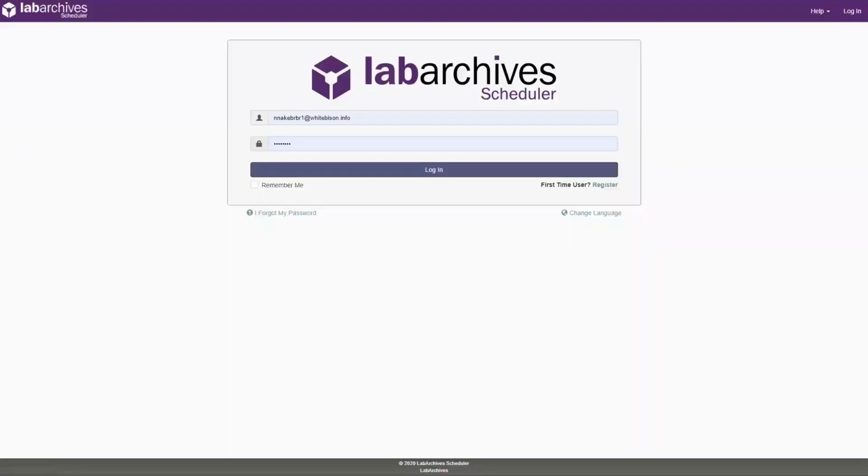This video will cover the main features of LabArchives Scheduler that are used by the average end user. To learn more about how to set up a new LabArchives Scheduler organization and how to utilize the features accessible only to administrators, please see our LabArchives Scheduler admin video. LabArchives Scheduler allows you to schedule and organize reservations for important resources or equipment at your institution.